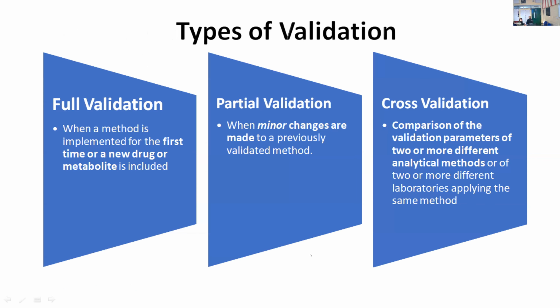So there are types of validation. Full validation: when you have a new molecule or a new drug to be analyzed for the first time, then the full validation procedure or steps need to be undertaken. And the second type is the partial validation.